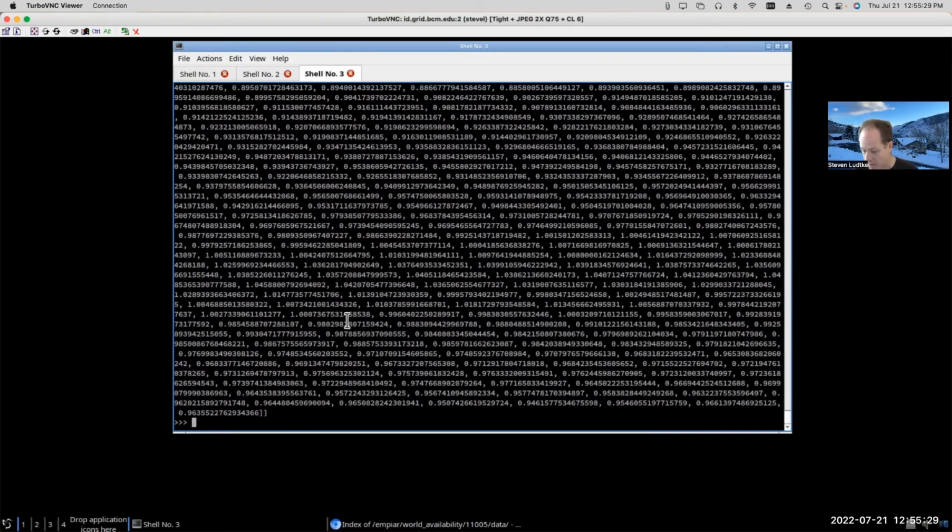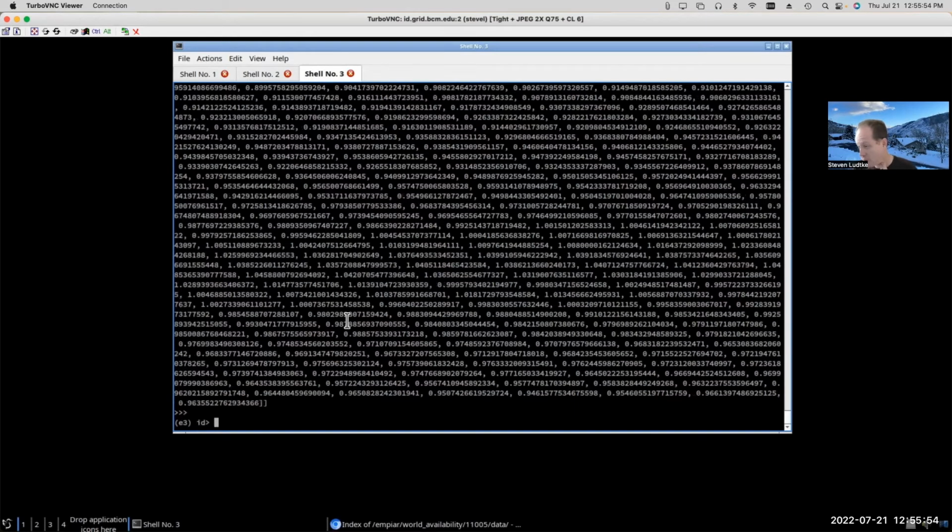I could also manipulate the dictionary. If I wanted to add some new metadata item, I could say J of my data is equal to 120, something like that. And that would actually modify the contents of the JSON file. I don't want to do that in this case, but it wouldn't hurt anything, but I don't want to actually modify it. Right. So we have an object type for interacting with these LST files. We have an object type for interacting with JSON files.